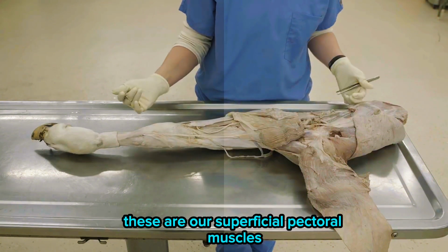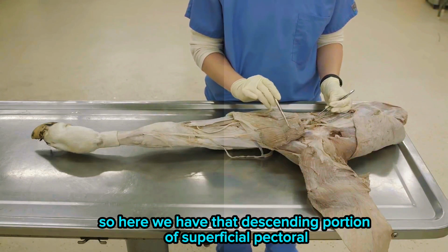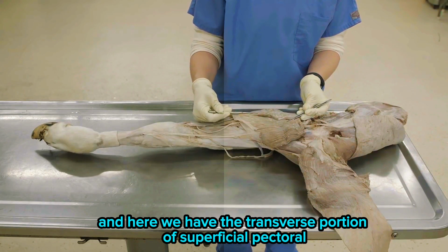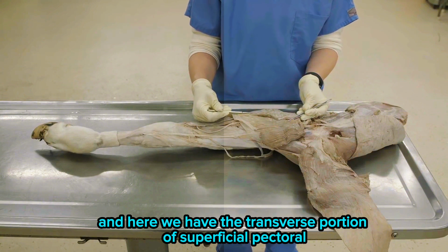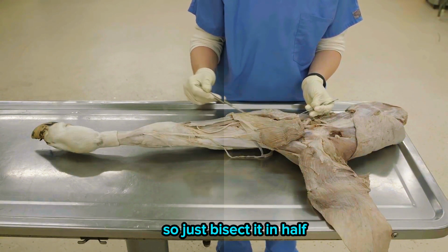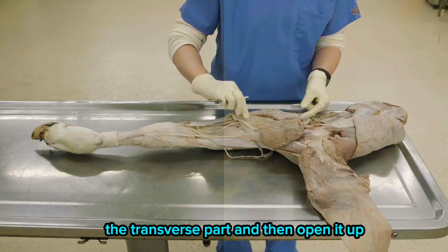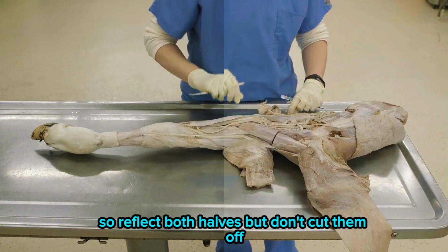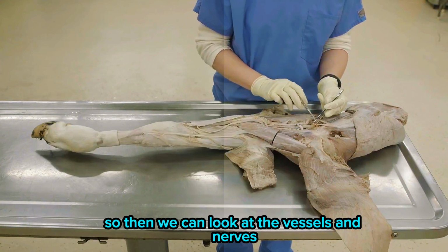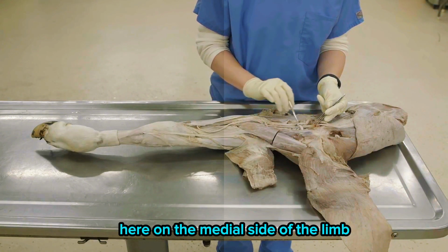These are our superficial pectoral muscles. Here we have that descending portion of superficial pectoral, and here we have the transverse portion of superficial pectoral. You want to make one transection down the middle, so just bisect the transverse part in half, and then open it up. Reflect both halves, but don't cut them off. Again, you want to keep them attached. So then we can look at the vessels and nerves here on the medial side of the limb.